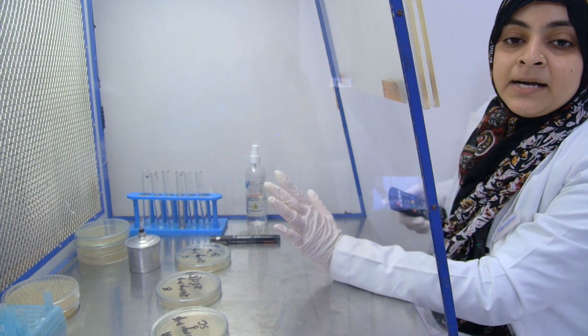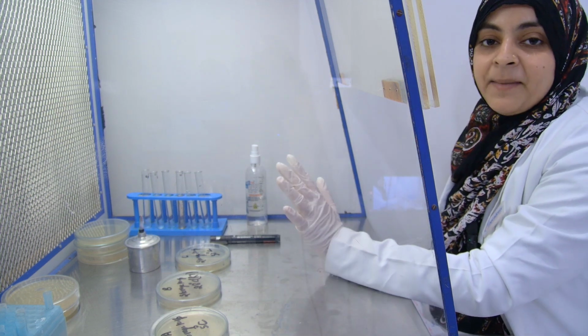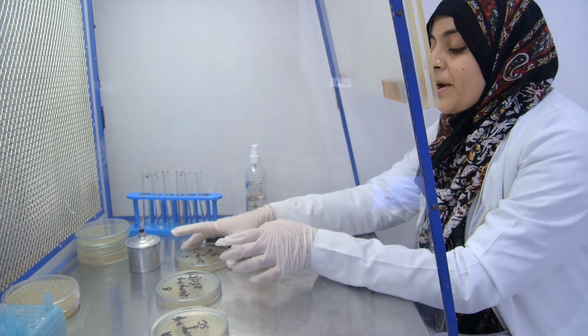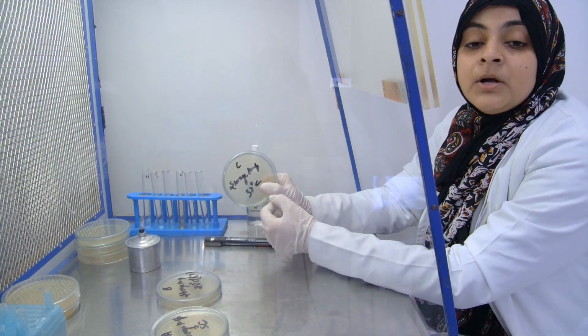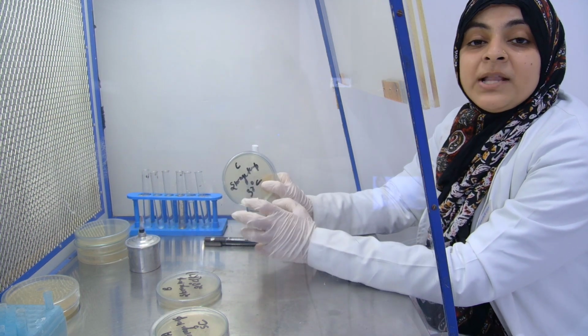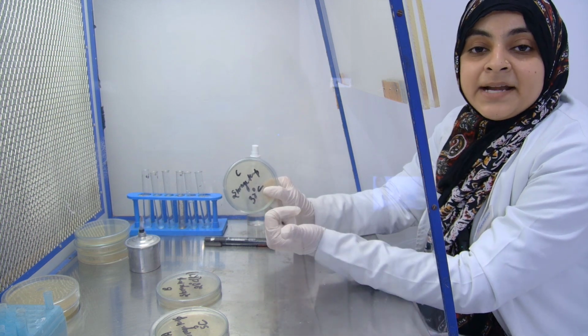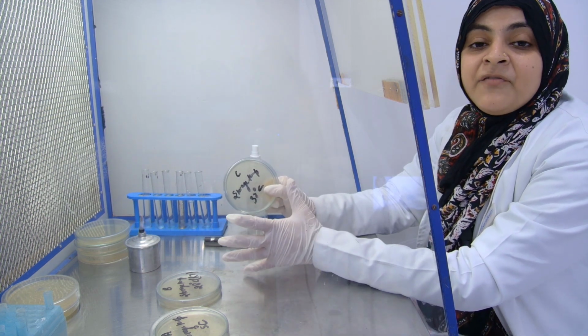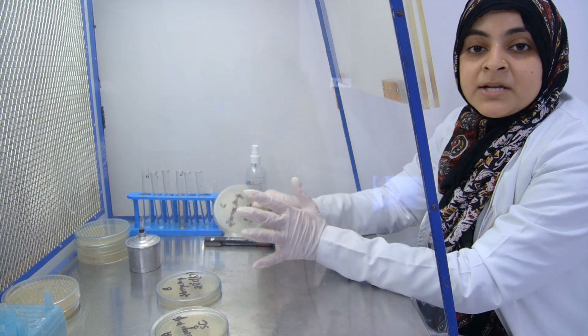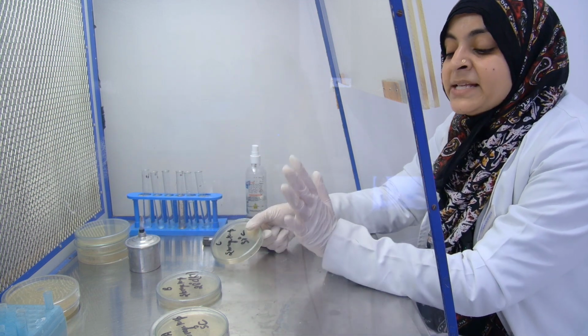Now in the third test tube, in the third Petri plate, what do we write down? We write down 37 degrees Celsius. So after inoculation, what do we have to do? We put that Petri plate inside the incubator for 48 hours. Then after 48 hours, we see the result in all these plates.